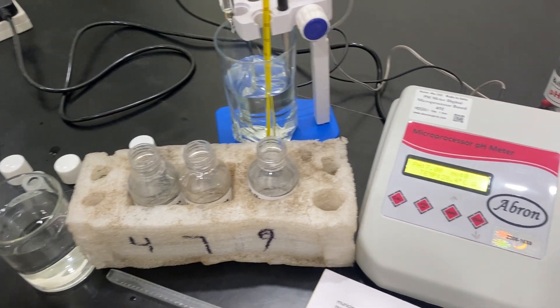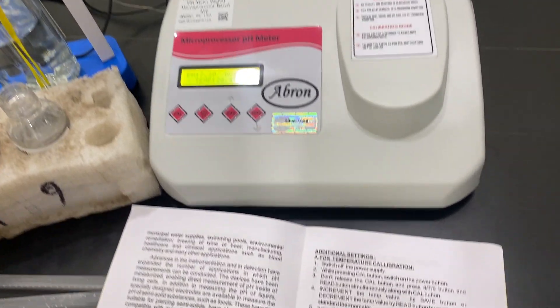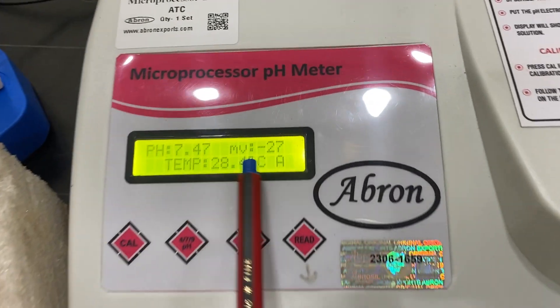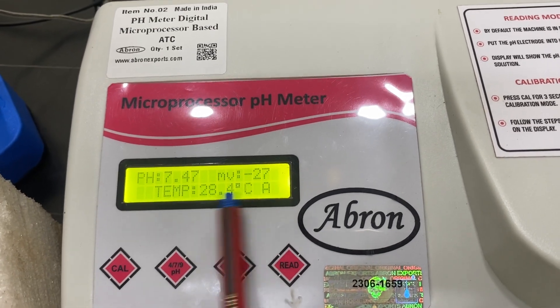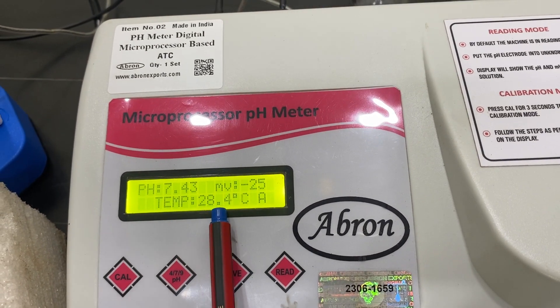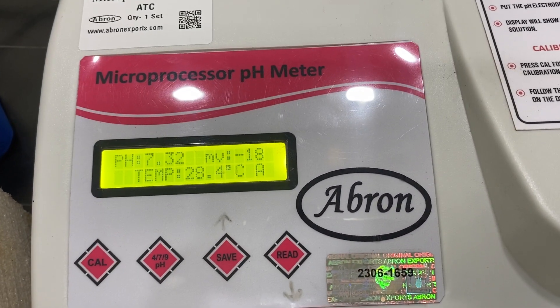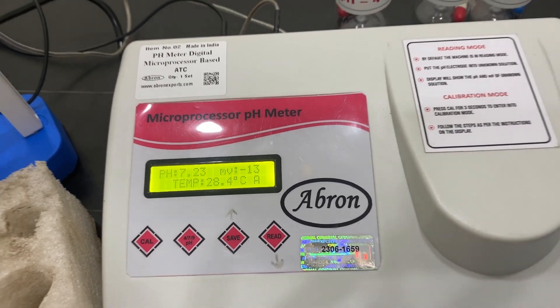Now I am putting the electrode in an unknown solution. The pH is coming up as 7.45, mV is minus 27, and temperature is 28.4°C. I can adjust the electrode so the solution is settled and it shows the proper reading.